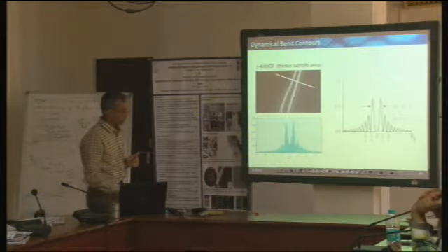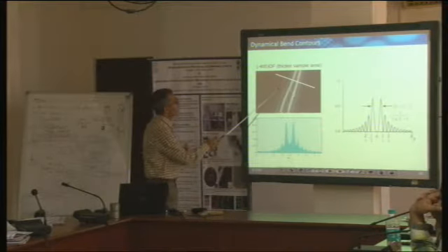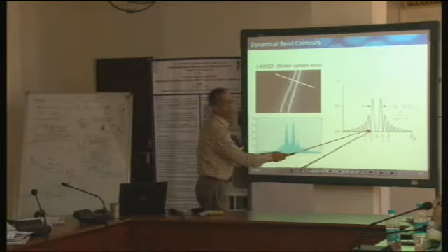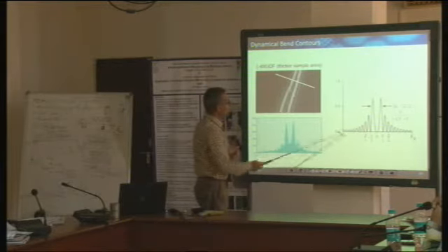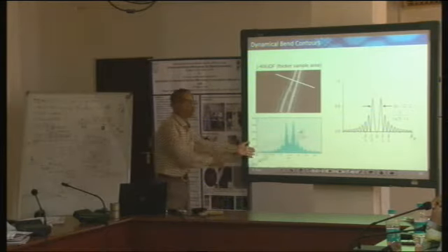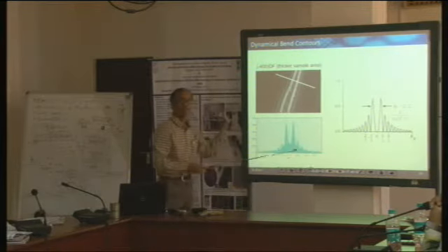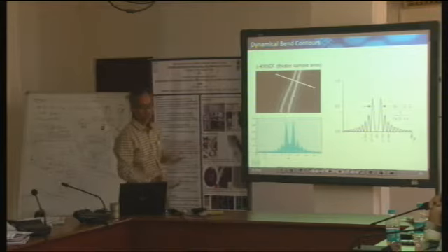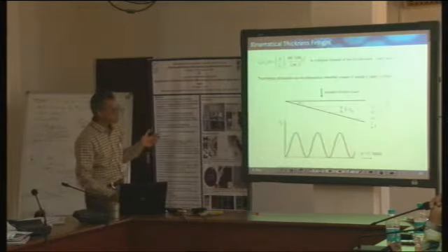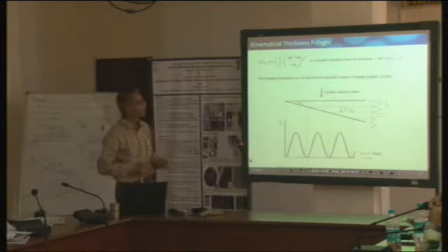So now, using that modified equation, from a thicker area, this is the experimental intensity profile, and this is the theoretical profile using the modified equation, and they match much better. So that's done. This was for the bend contours. And thickness fringes, I think we have spoken of quite briefly.